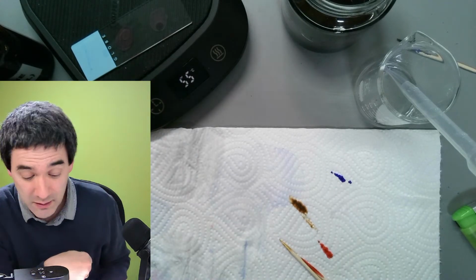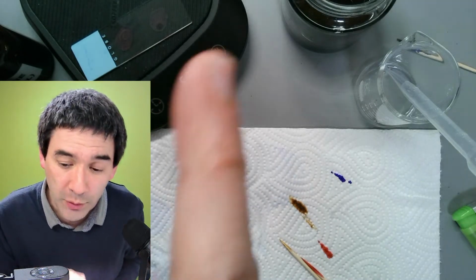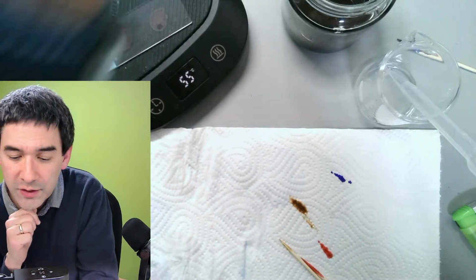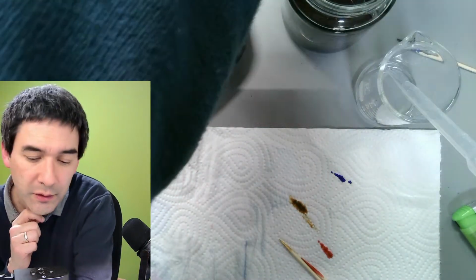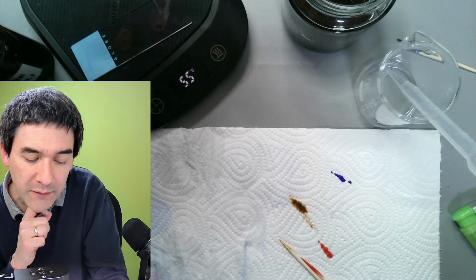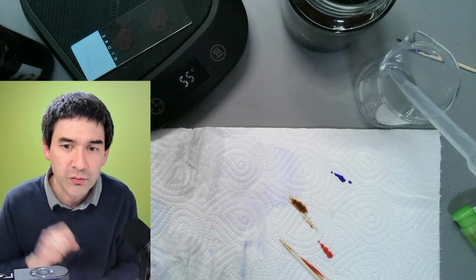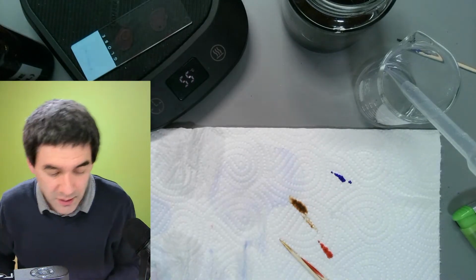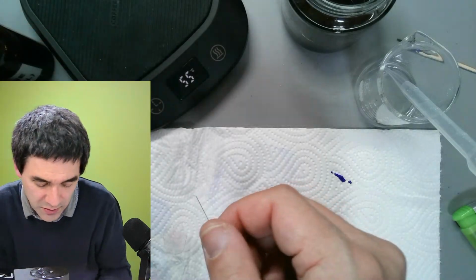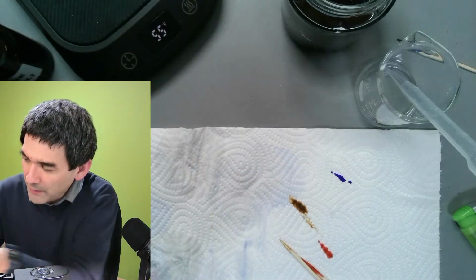They're both Gram negative, could be. At least the E. coli one should be Gram negative. But then I'm going to show you over here. Where is it? No, it's not this one. Is it this one? Ah, yeah. From this morning I've got another one prepared already with some immersion oil, which contains Gram positive and Gram negative ones. This one now is dry. That's good.